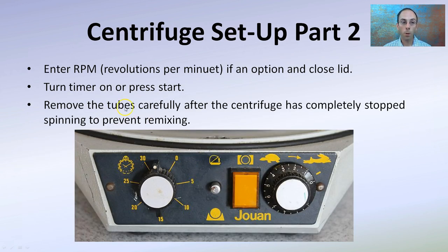Lastly, enter the RPM — revolutions per minute. Close the lid; sometimes RPM is preset, sometimes you can adjust it. Turn the timer and press start. Remove the tubes carefully after the centrifuge has completely stopped spinning to prevent remixing. Some separations will be more stable than others, so carefully remove the tubes. You may want to decant — remove that top liquid portion — or keep the pellet and extract it, whatever the protocol calls for. This is the proper way to centrifuge so that you eliminate errors in this separation technique.